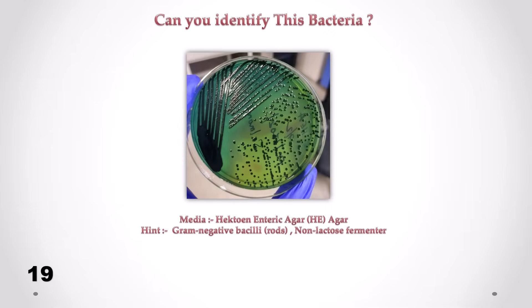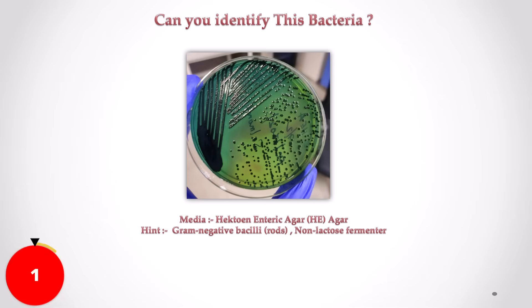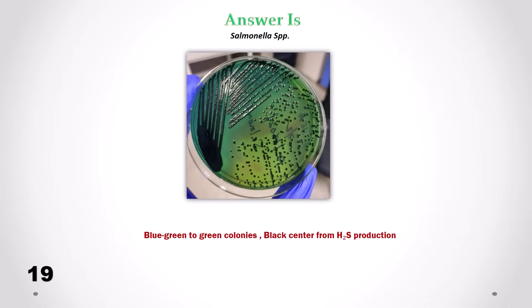Can you identify this bacteria? Correct answer is Salmonella. We can see blue-green to green colonies with black centers from H2S production.